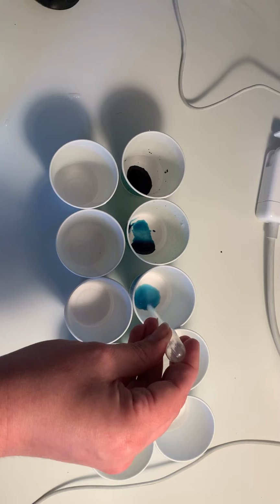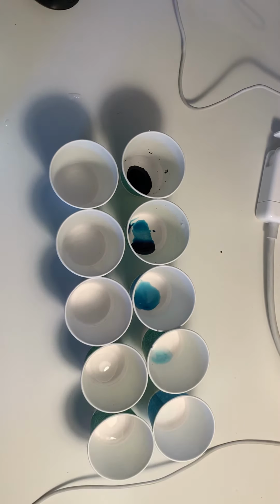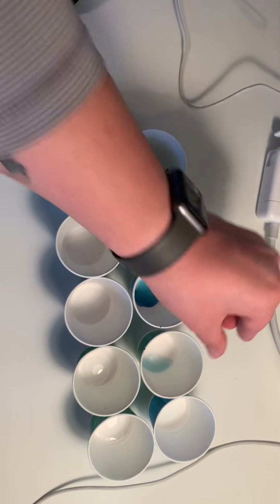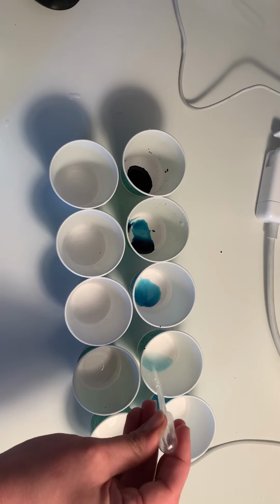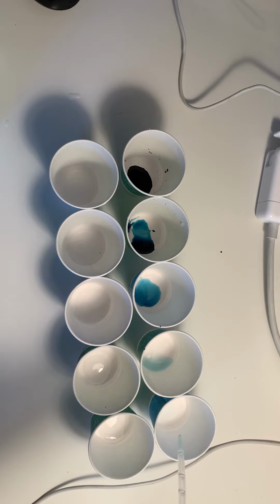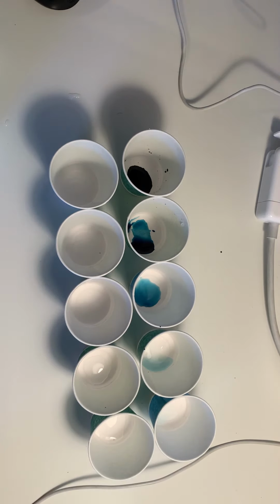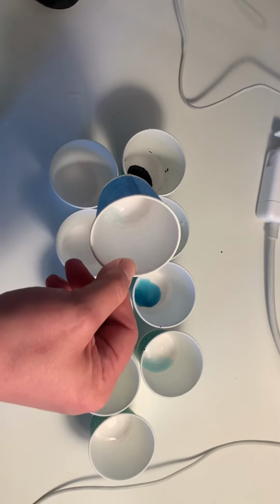I'm going to take 1 drop from there, put it in there, and then remember I gotta rinse out my pipette. Now as you can see, cell 4 there, all of a sudden that is barely a blue color. Let's see what happens in cell 5. I'm going to move cell 5 here for you a little bit so you can see that liquid in there.